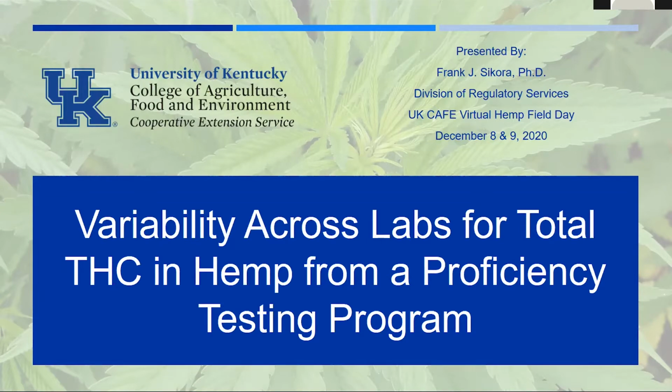It's very important to have a program like this where the labs can compare their results and determine how well they're doing with respect to other laboratories. What I'll present today is total THC results from this program and how it relates to making regulatory decisions.